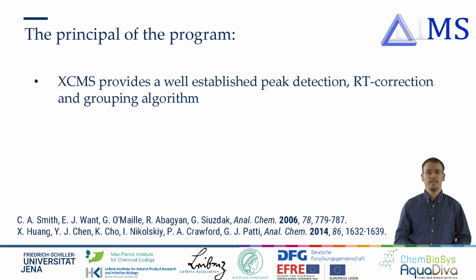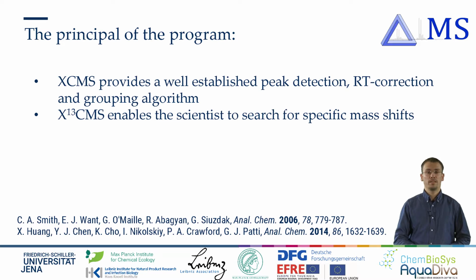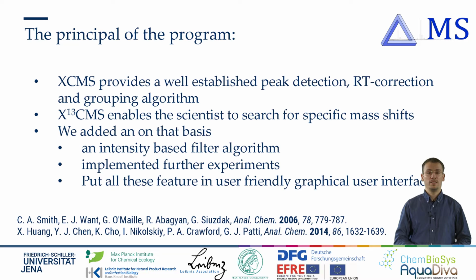Our program is based on the well-established XCMS pipeline, including peak detection, retention time correction and grouping. As the next step, we use the known X13CMS tool, because this can detect the element-specific mass shifts. Finally, we further analyze these data using an intensity-based filter. Furthermore, we also enable more experimental setups, which we will introduce later. To make our tool usable for non-R programmers, we implemented everything in a user-friendly graphical interface.